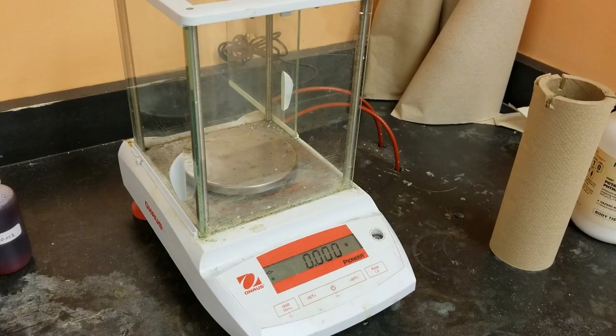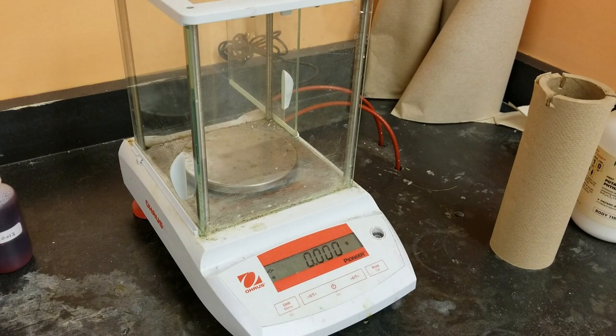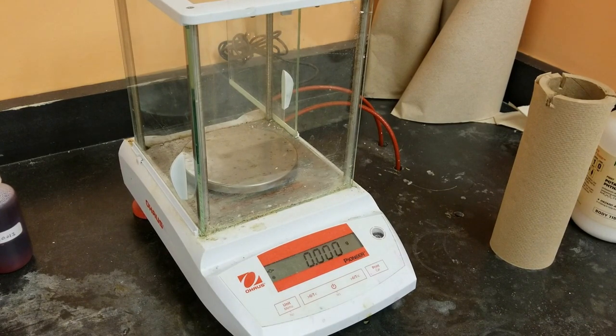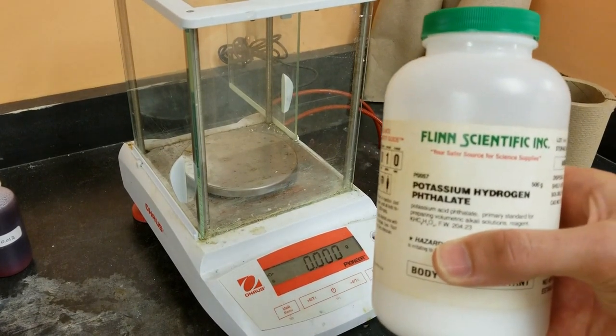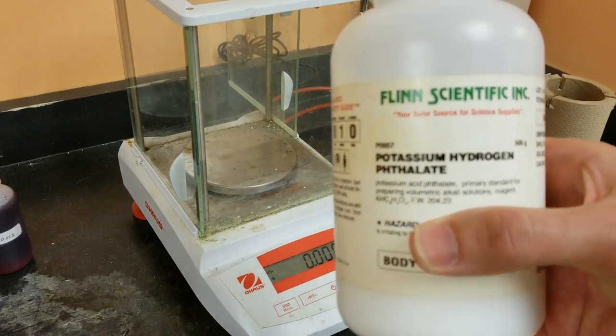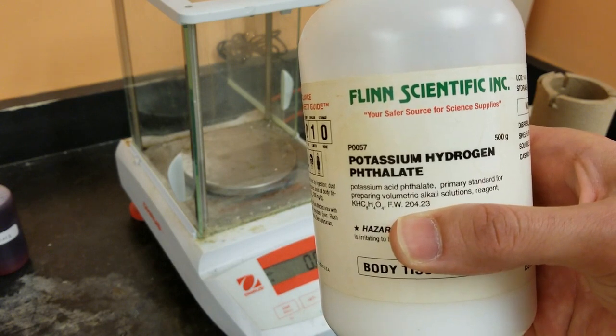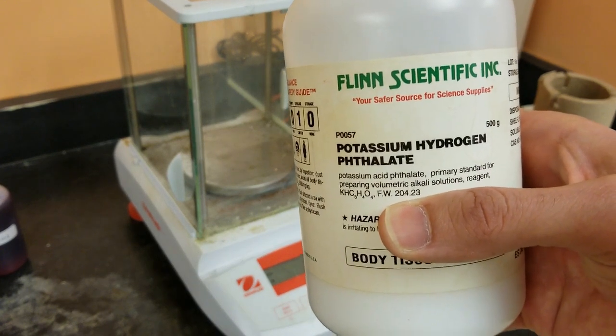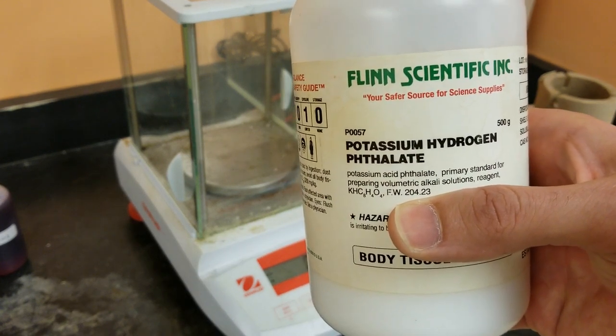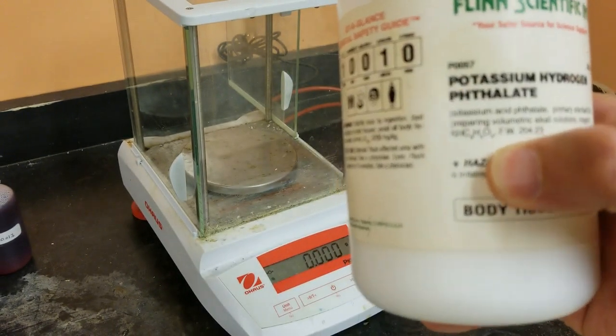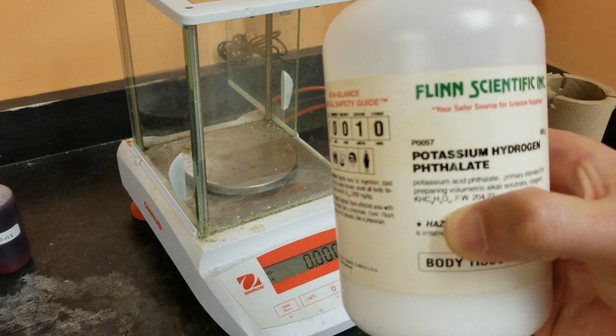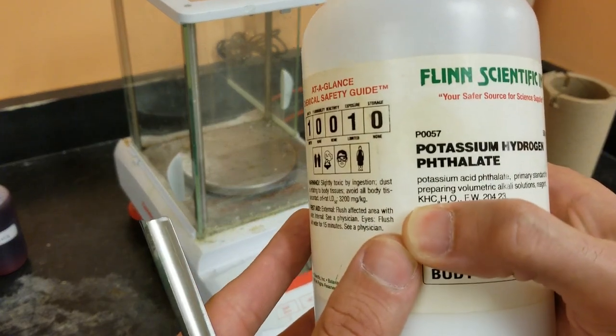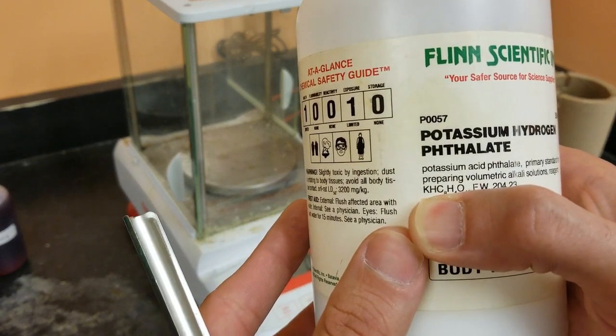All right, we're over at the analytical balance to weigh out our powdered acid. So our powdered acid is something called potassium hydrogen phthalate. You can see its molar mass, its formula weight, is 204.23 grams per mole. Its formula is here. It's an acid because it loses that hydrogen after the potassium.